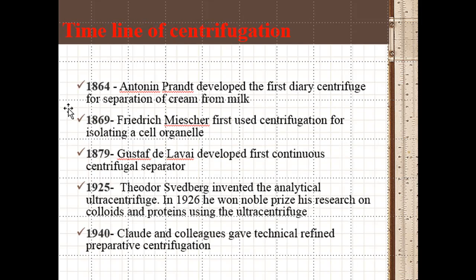The timeline of centrifugation. Here are some of the scientists who made contributions in this field. Svedberg invented the analytical centrifuge, and in 1926 he won the Nobel Prize for his research on colloids and proteins.